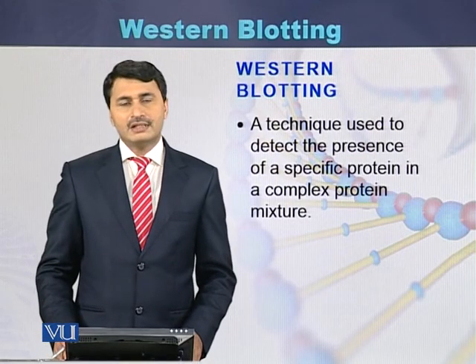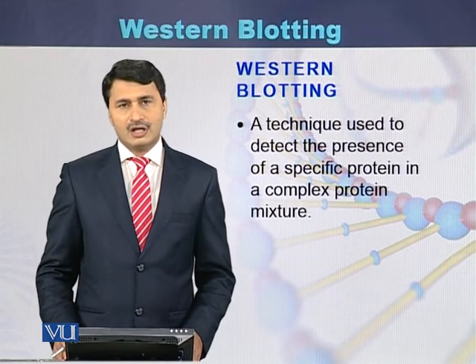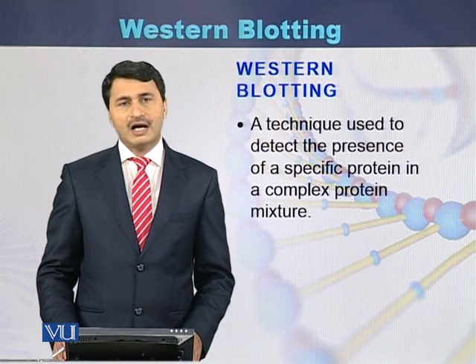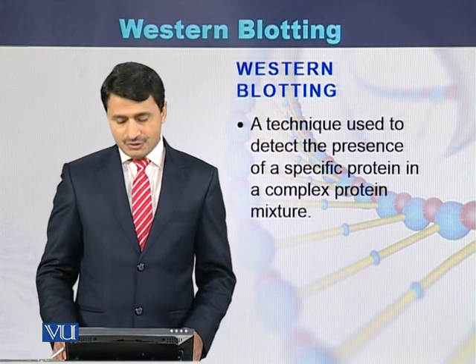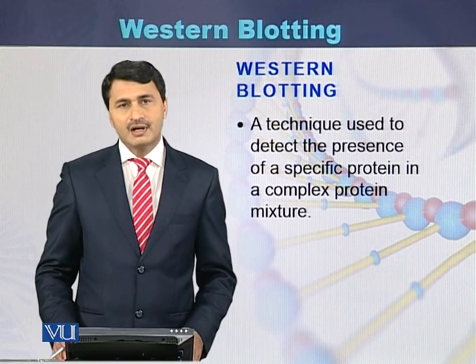Western blotting is another type of molecular biology technique, or it is also called a technique of biotechnology, which is used to detect the presence of a specific protein in a mixture of proteins.